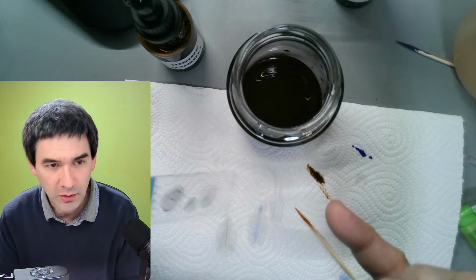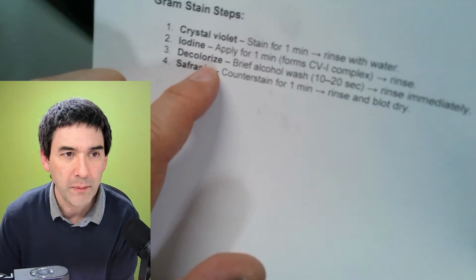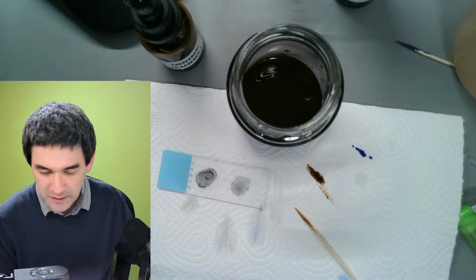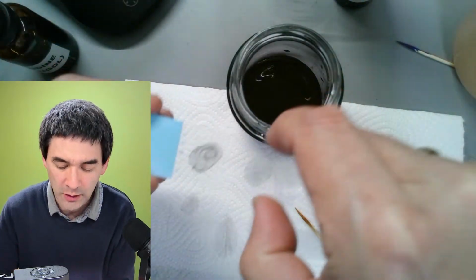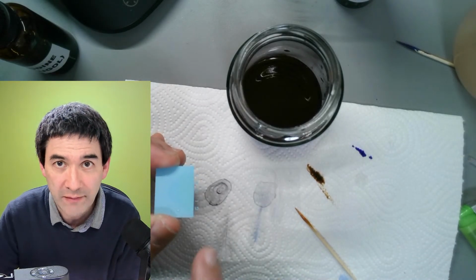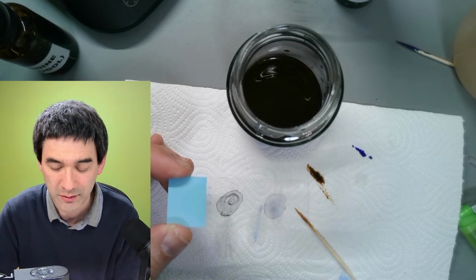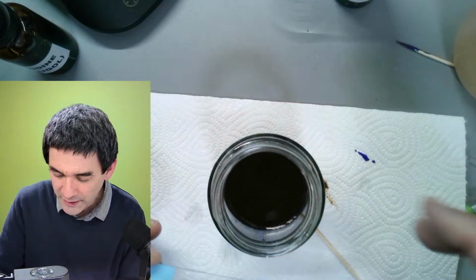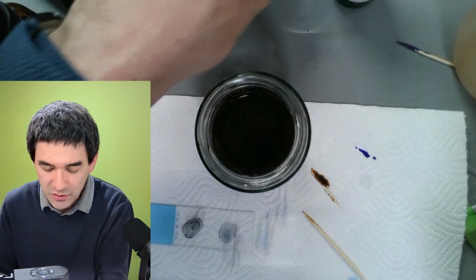Okay, so now we've got this here. The next step is critical: brief alcohol wash and rinse immediately. So I have to be a little bit careful. I have to wash it with alcohol, and the gram-positive cells will retain the crystal violet iodine complex, and the gram-negative cells will lose the color. That's the idea here. So how am I going to do that?